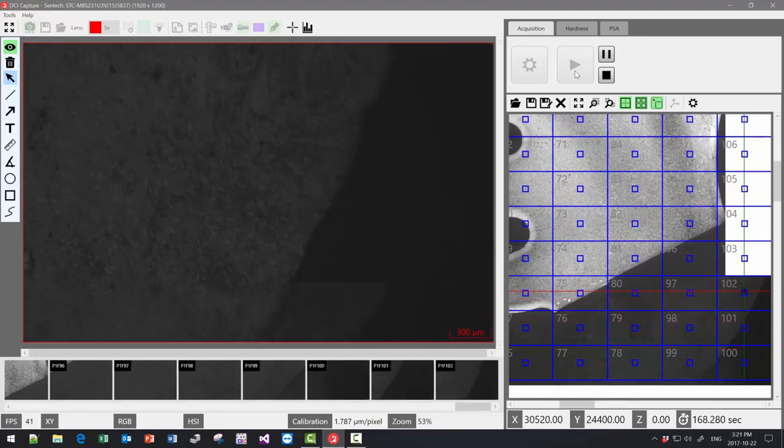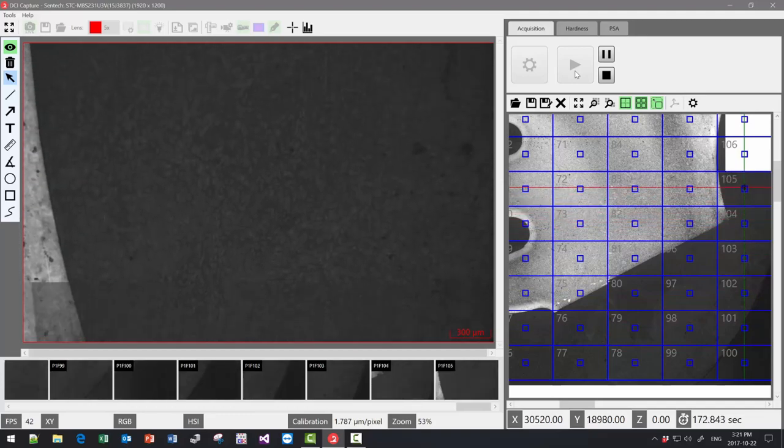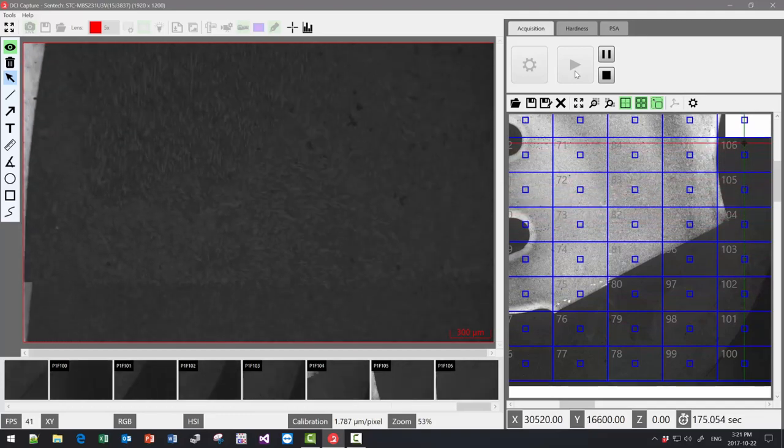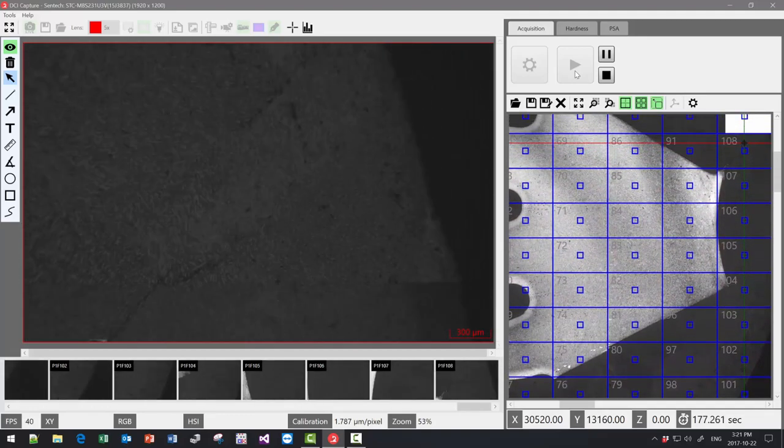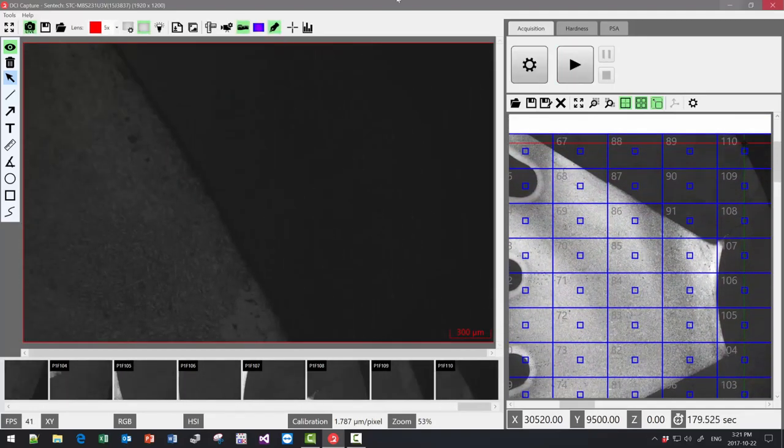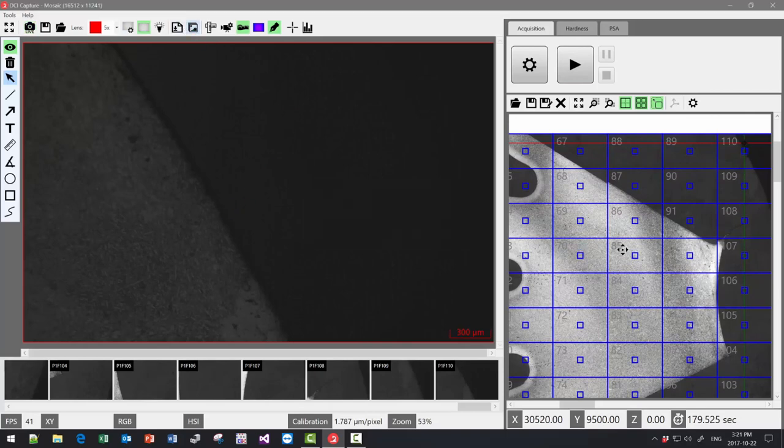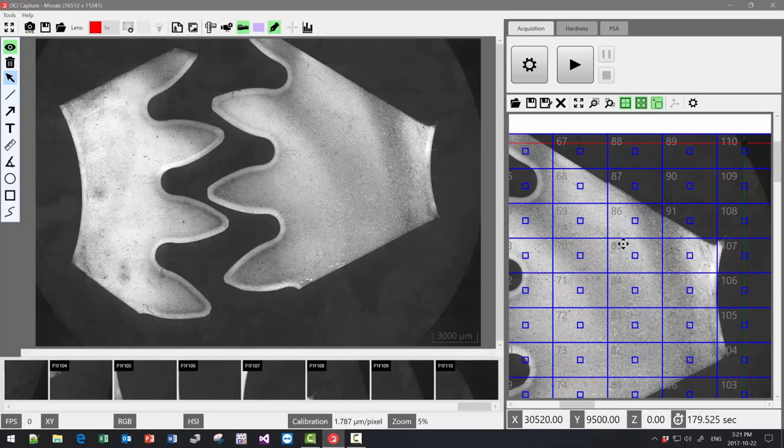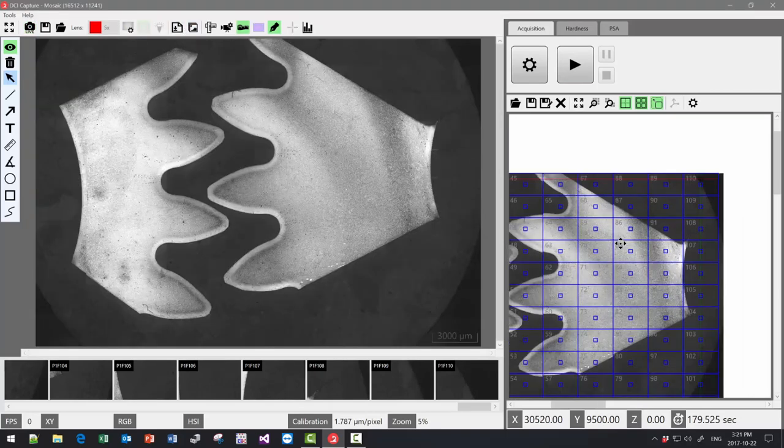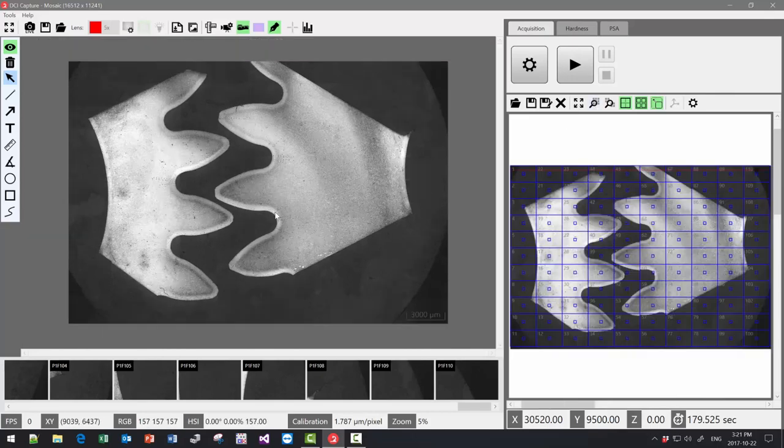Once every field is covered, simply press the build mosaic button. You now have a mosaic image of 16,512 by 11,241 pixels.